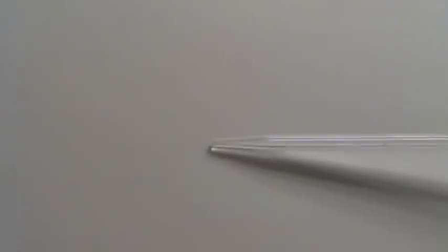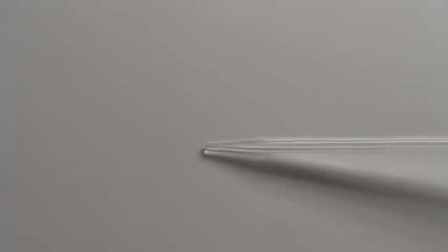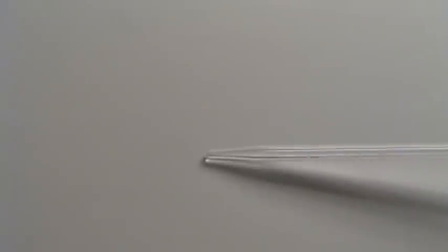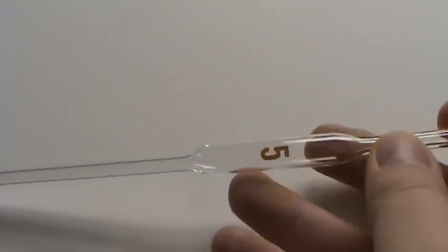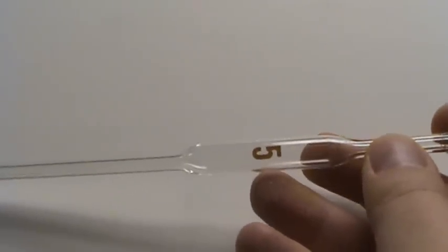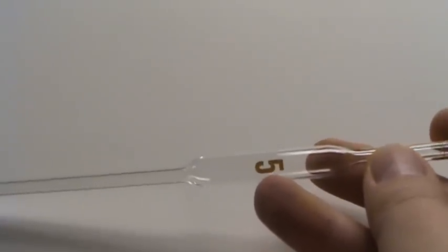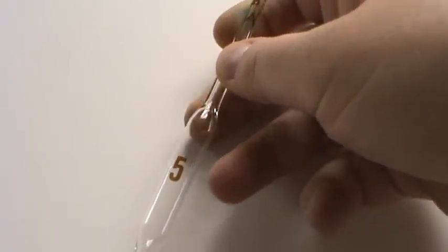So let's start down at the tip. It really doesn't look that much different from a burette tip. It's just a very small opening, usually referred to as a jet tip that lets us dispense liquids. As we move up, we get to usually a bulb of some sort that lets us hold a larger volume of liquid. The bulb usually also has the size of the pipette listed. So this particular pipette is a five milliliter pipette.